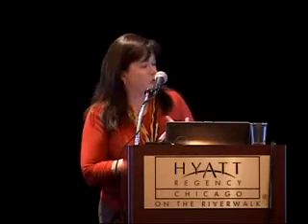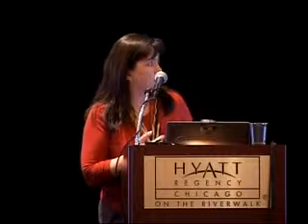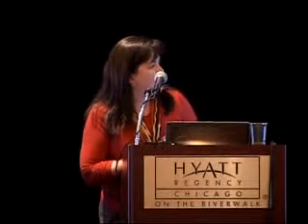And then there's interfaces. This is the one where I really have to sit down and think about all the interfaces that we need and make sure that they're all built into the contract. So you kind of have to do an inventory of your laboratory system and what this system needs to be able to do. What other systems does it need to be able to communicate with? Do you have an internal EMR, an external set of EMRs, and this would include outside hospitals, web portals, patient portals, if legal, because in some states those aren't exactly legal. Internal laboratory information systems, external ones, instruments, and middleware.